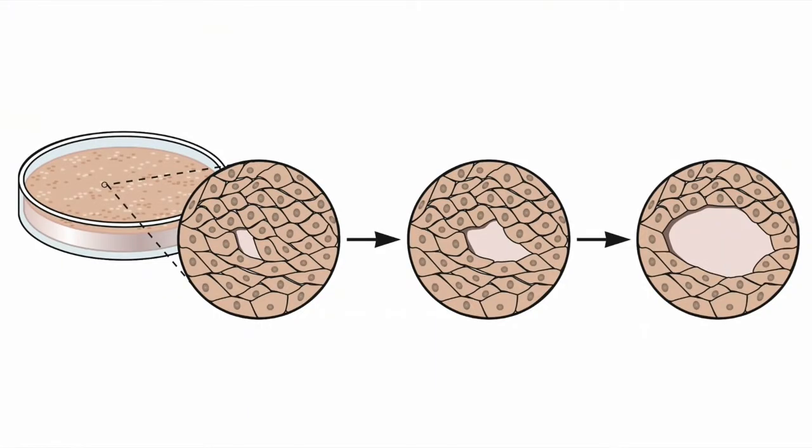This is important because when viruses are released from a single cell, they will be restricted to infecting neighboring cells by the agar. If the cells were covered with a liquid medium instead, the virus particles released from the first infected cells would go on to infect all cells in the entire culture, and we'd never be able to count individual infected cells. The formation of a plaque is shown in this series of drawings.